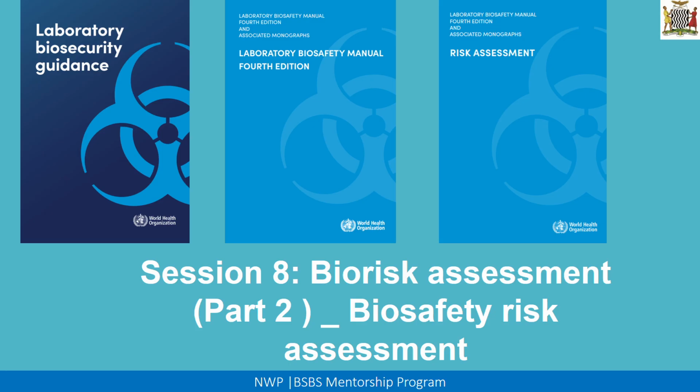In this session, we will mostly look at the biorisk assessment. This is part 2 of the biorisk assessment sessions. In part 1, we mostly looked at the basic principles of biorisk assessment. We introduced risk, and we also looked at risk being a function of both likelihood and consequence. Then we looked at some real-life examples of doing a risk assessment. This is where we looked at the risk whilst you are crossing the road, and we also compared that risk to the laboratory setup.